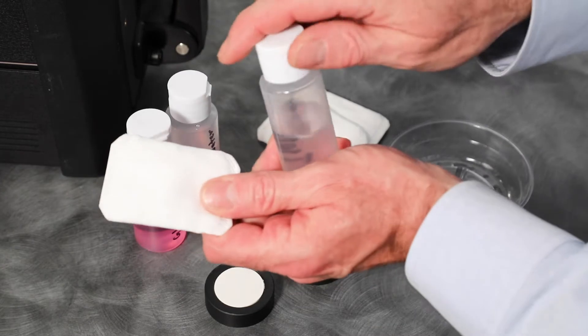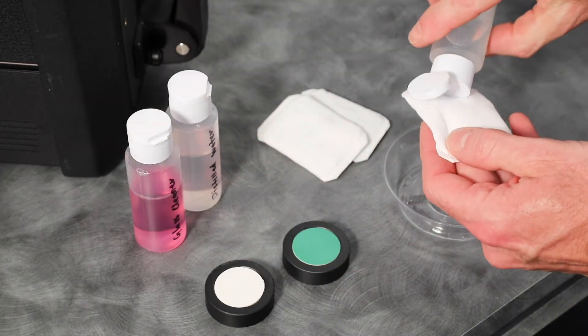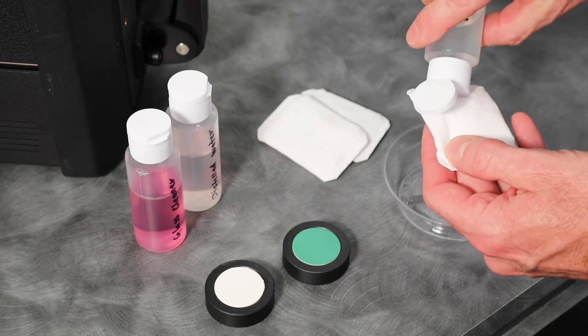Apply a small amount of isopropyl alcohol onto a portion of your lint-free wipe and clean the entire surface in a circular motion.